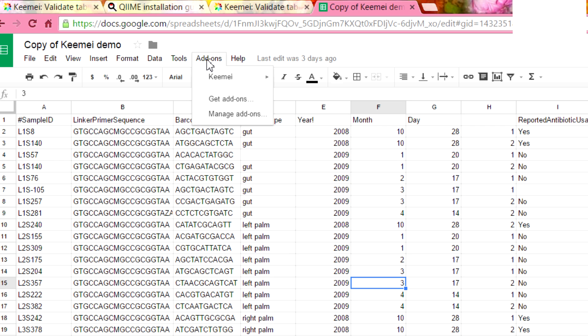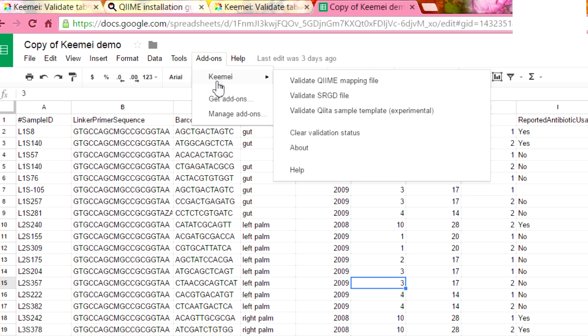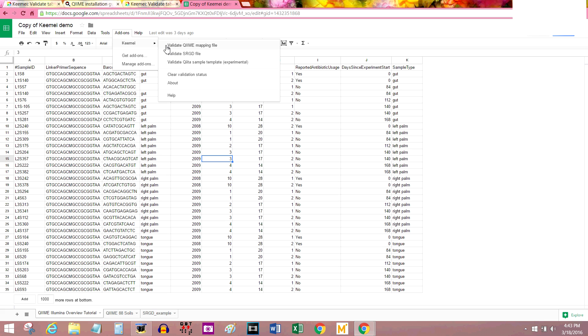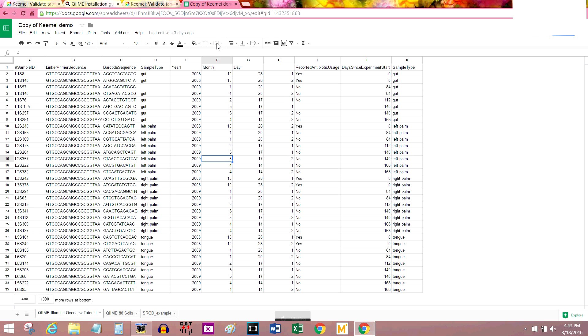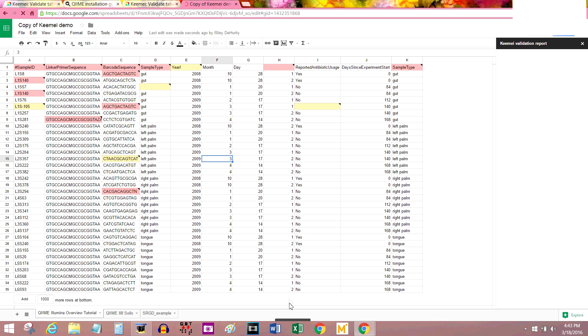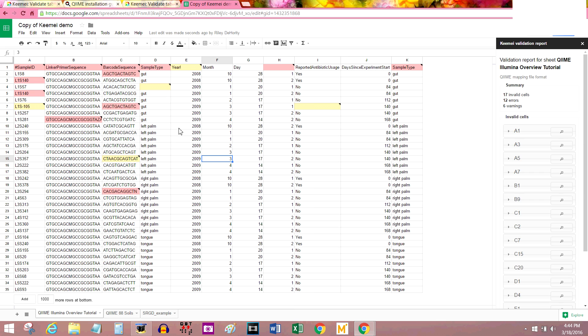So the first thing that we're going to do is validate this sheet using the QIIME add-on. Go up to add-ons, QIIME, and validate QIIME mapping file. See it's working. And if you notice, some cells have lit up.